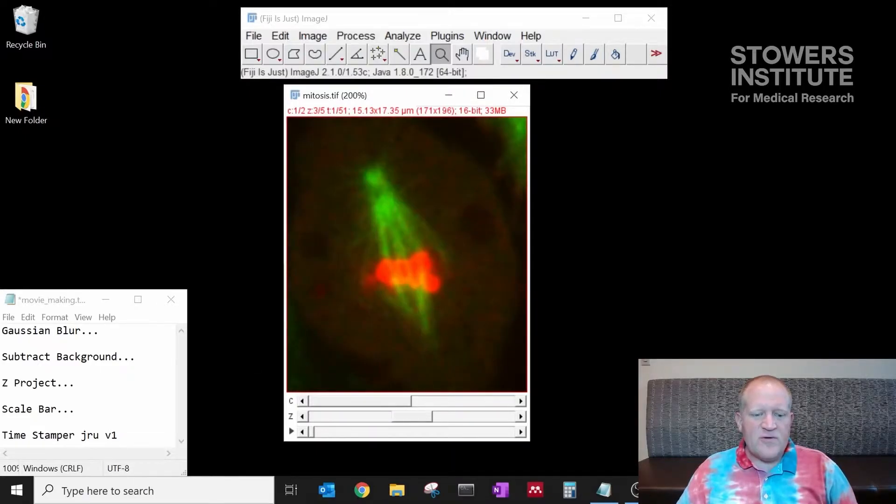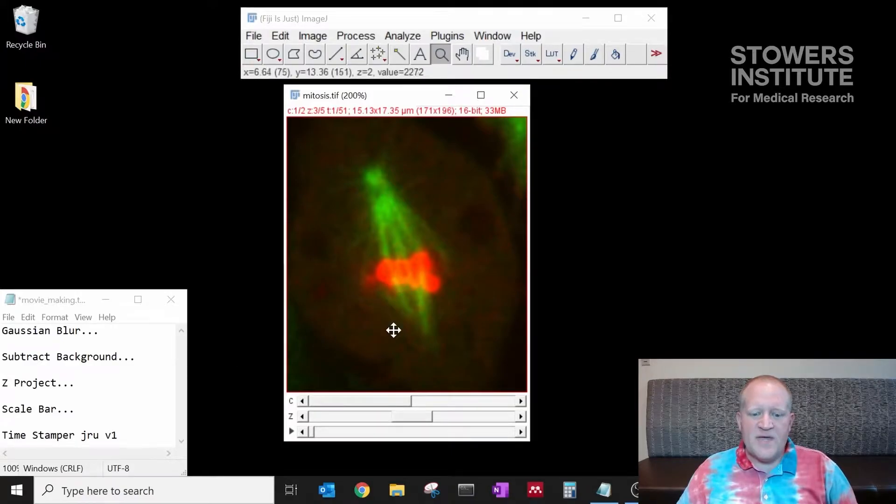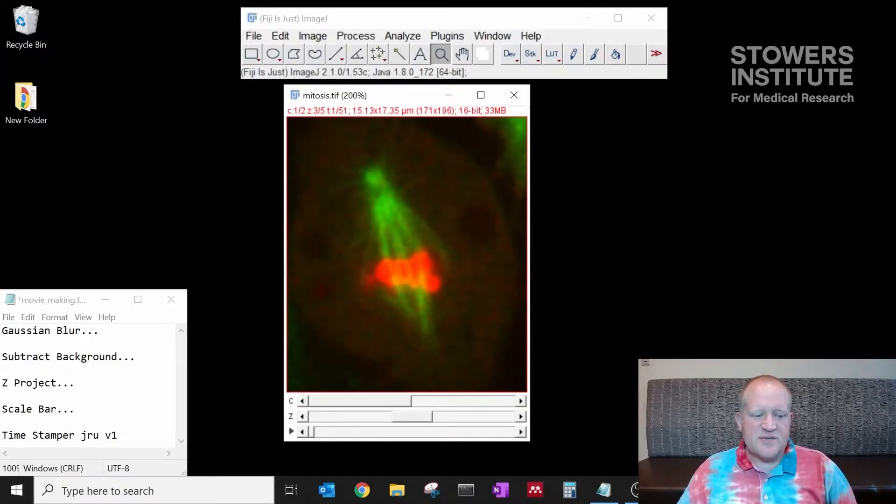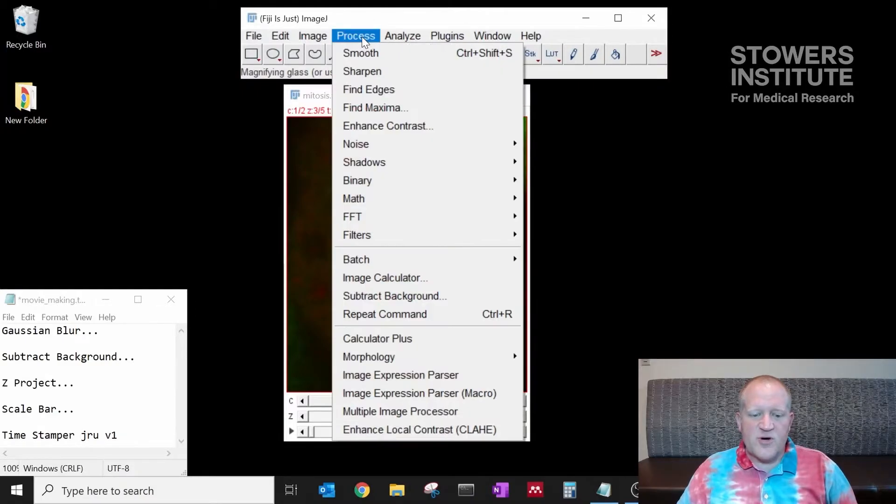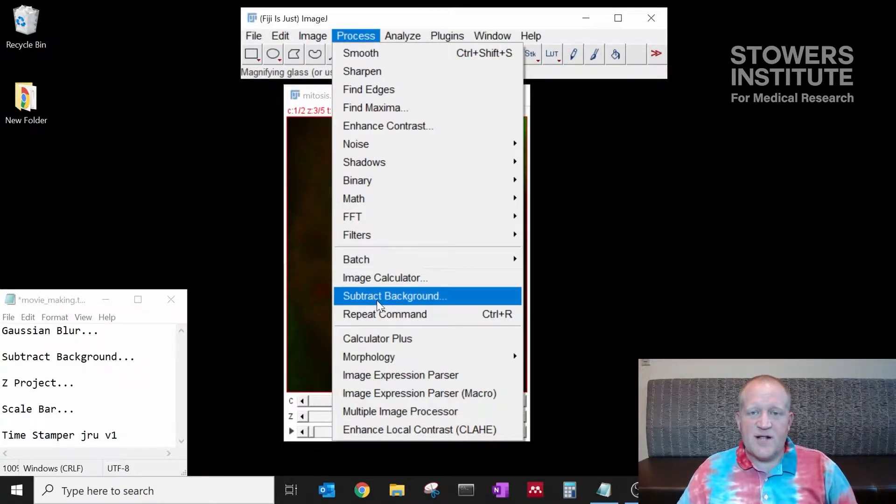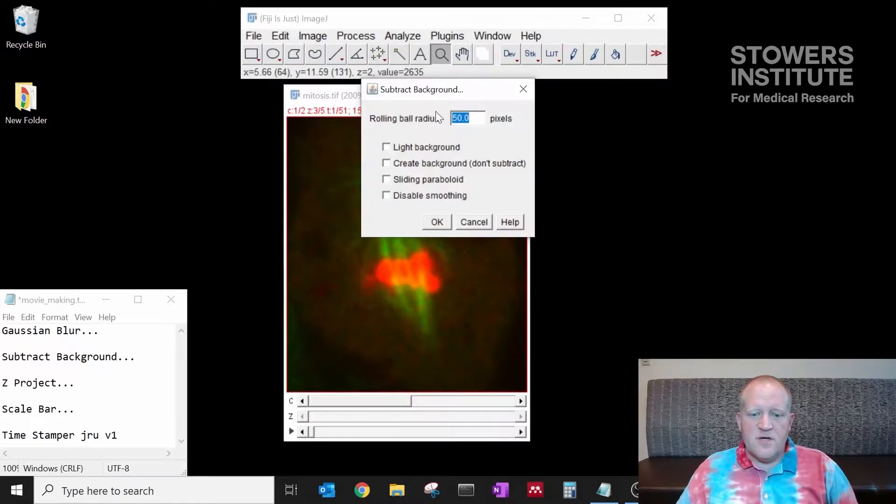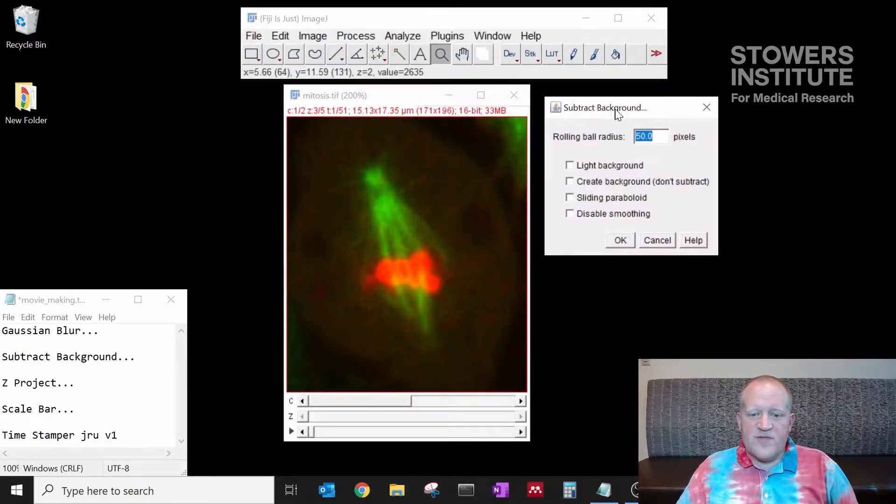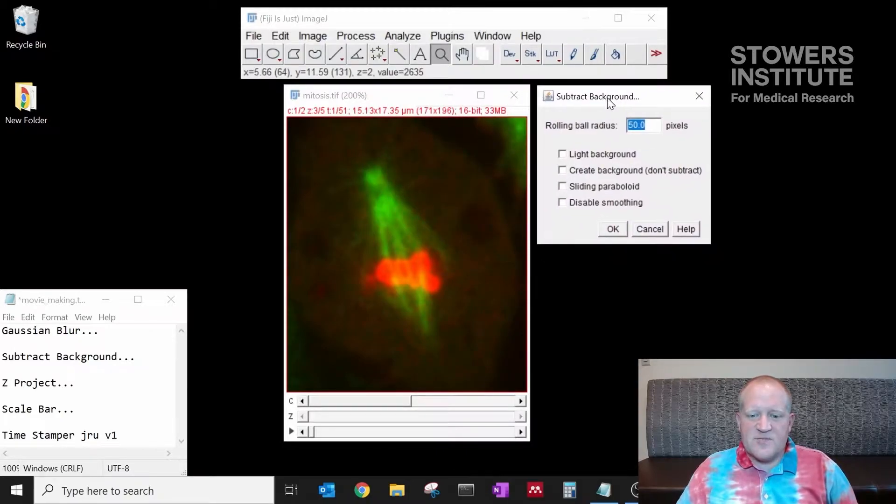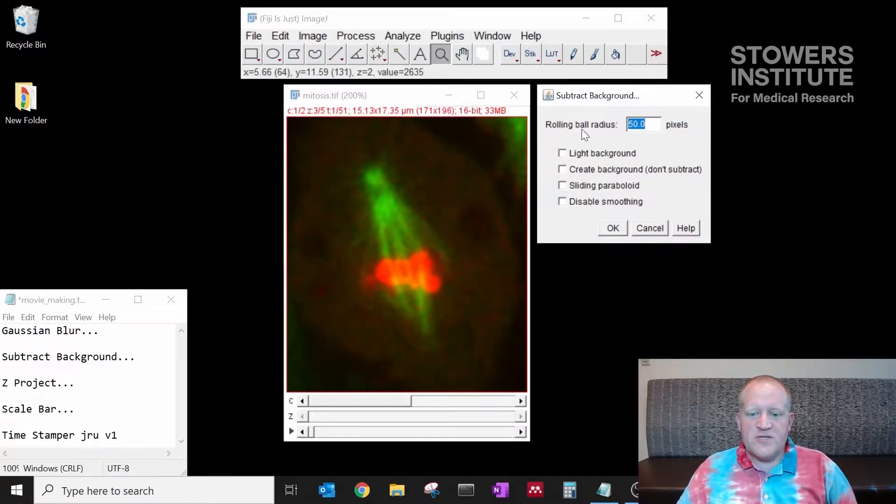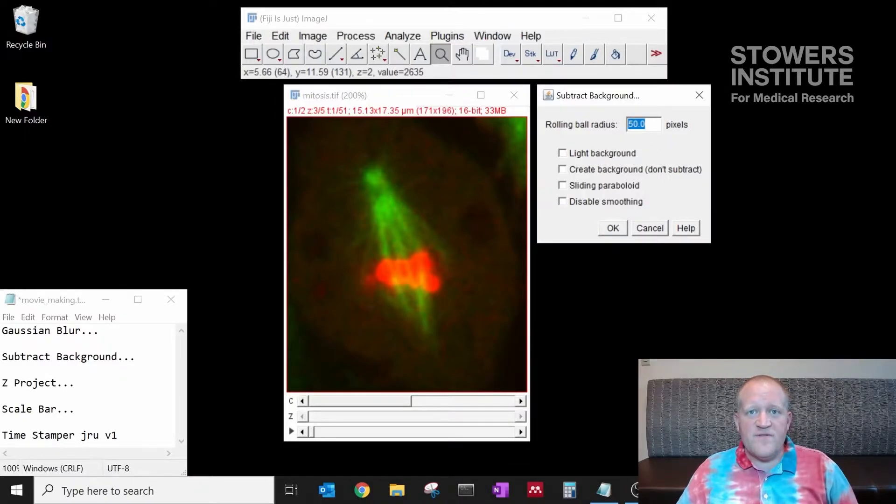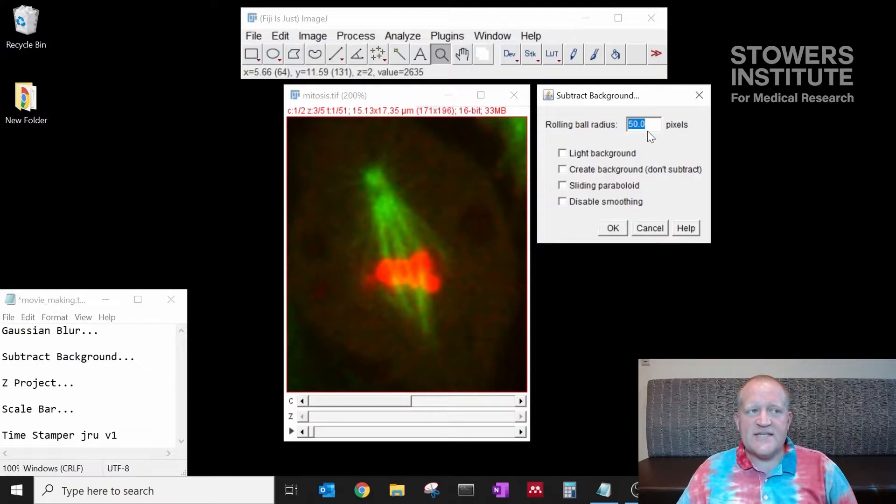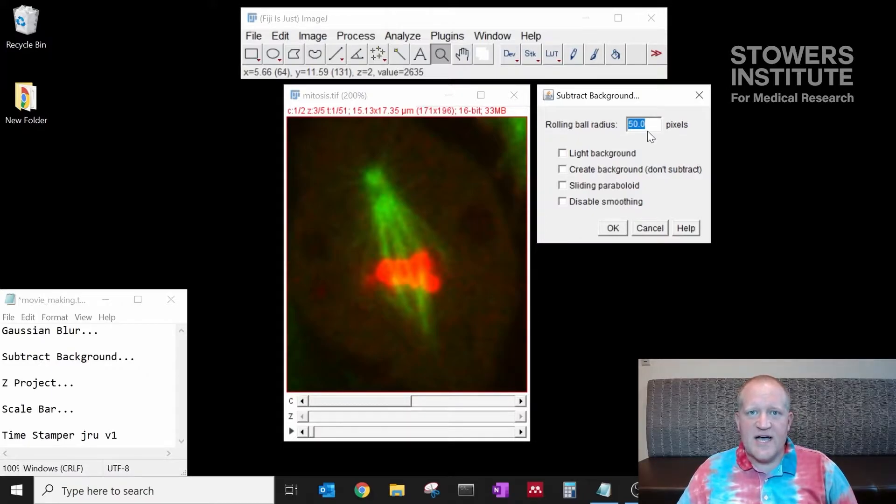Now we want to subtract background and we're going to do that using the subtract background plugin which is under process subtract background. For this background subtraction we want to use a radius that's appropriate for our data.